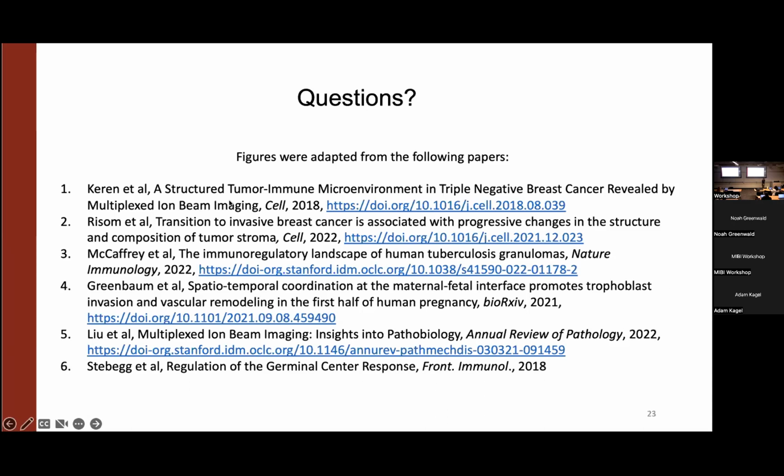Okay. So the question was, how do you decide what distance limit to use? We use 100. How did you pick that? So it was picked specifically for the tissues we're looking at. It made sense, but you can play with it.